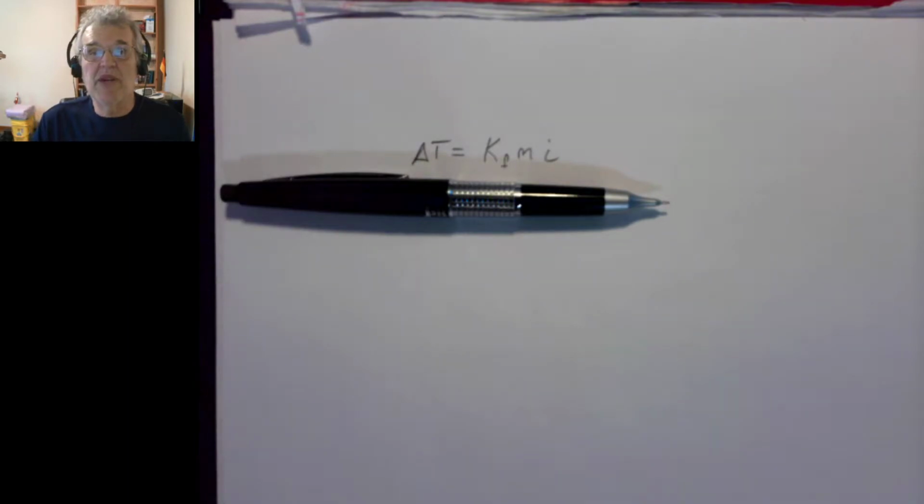Okay, the next lab we're going to be doing is one dealing with colligative properties, specifically the colligative properties that have to do with freezing point depression. You have freezing point depression and boiling point elevation. We're going to deal with freezing point depression, and we're going to really deal with determining the molar mass of a compound based on how much of a freezing point depression we get when adding an amount of that compound to an amount of a solvent that we have inside there.